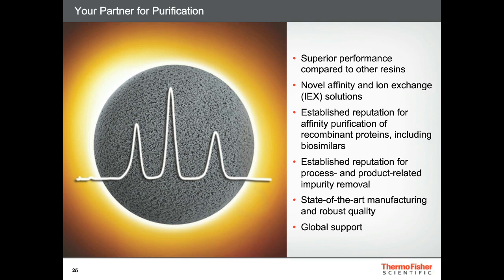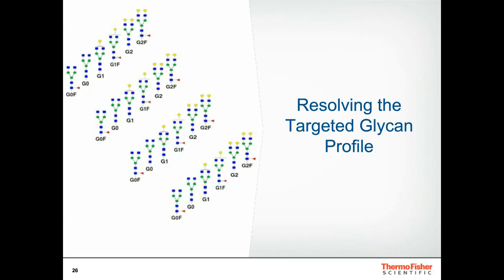Shahir Khan: Thank you, Ryan, for that very nice overview of the available tools for precision glycan control, increased titers, and glycoprotein purification. Following along the lines of what comes after an analytical scale purification, I will cover the products and the analytical tools used to analyze glycans. Before moving to the technical aspect of this presentation, let's have a quick look at the regulatory requirements of glycan analysis.